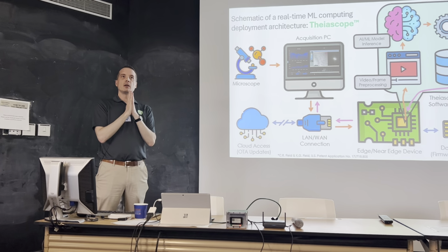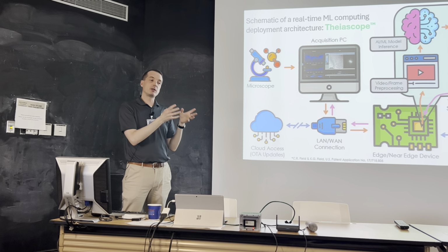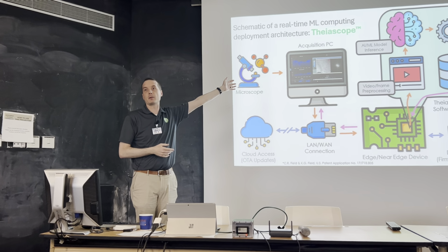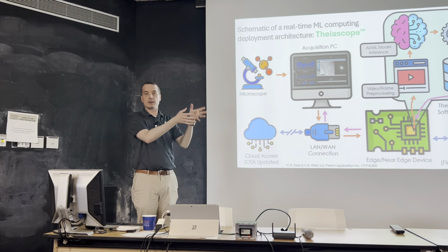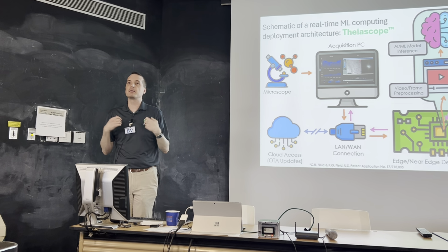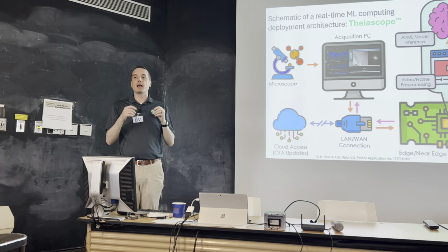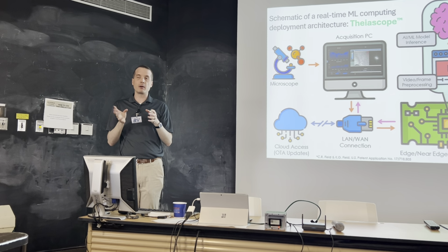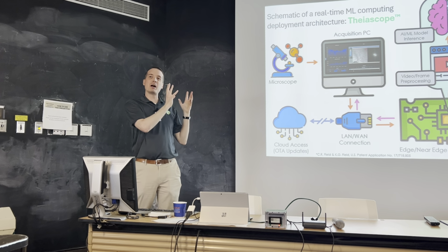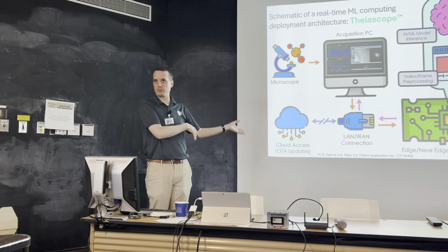So the idea was that there are groups at pretty much every institution that we talk to that are building models. And what generally happens is the microscopists, the scientists go to them and say, hey, can you build me a model that will automate this workflow so I don't have to draw boxes? And they will develop a model, and then they'll say, here's your model. And the microscope users will ask, well, how do I use the model? And so then they develop some script or something. Well, you type this code here, use this notebook, and then the microscope users say, well, I don't want to write code. And then the model developer says, well, we don't want to support or create a whole GUI or anything. We want to just run. We're more focused on that.